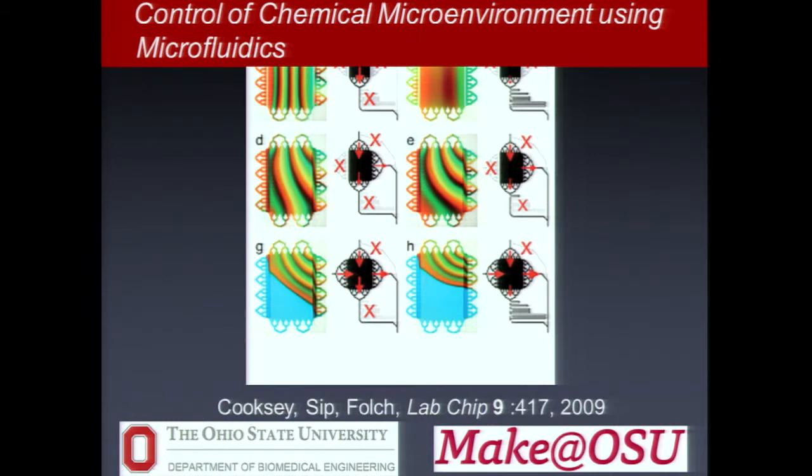And then just by controlling the flow rates, at the micro scale, flow is very laminar. Therefore, if you have two streams coming together, they will remain as two streams flowing beside each other, other than diffusion across the interface, unless you introduce some sort of three-dimensional vorticity at the micro scale. This is an interesting paper showing that by having all of these multiple inputs, you can create very interesting patterning of chemistry.